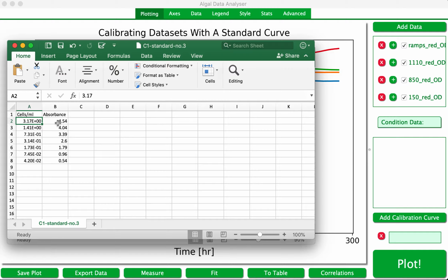and so that's enabled me to basically know exactly what the optical density actually is. So, for example, in this scenario, I got my dense culture and I diluted it down by half, and then half again, then half again, then half again, and each time I diluted it further in my laboratory spec and took a reading.